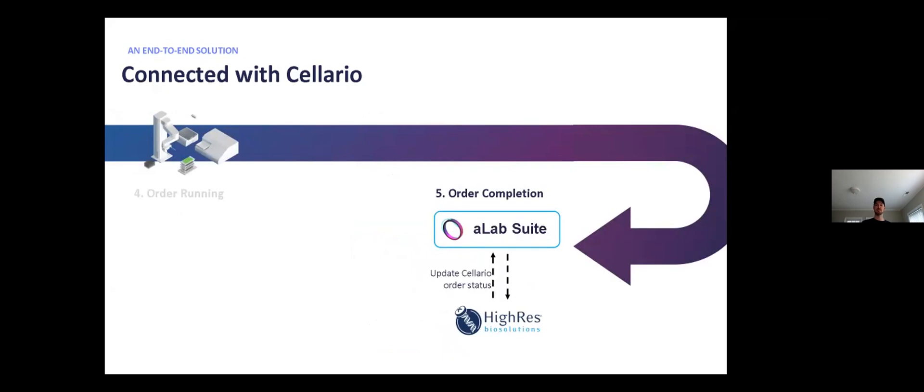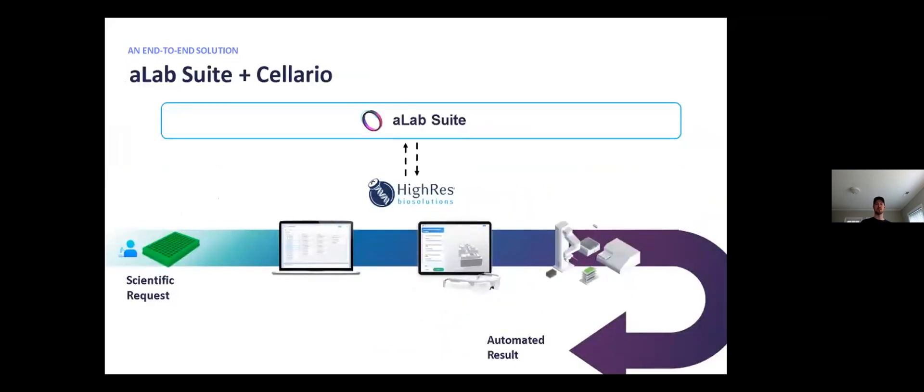And upon completion of the order, A-Lab Suite can update the digital twin with the resulting inventory status from Cellario, show the user how to unload the job using an unload assistant and the digital twin. And then once the user confirms that these plates have been unloaded in the digital twin, A-Lab Suite can complete the order in Cellario, thereby allowing Cellario to unload the plates from its inventory system as well.